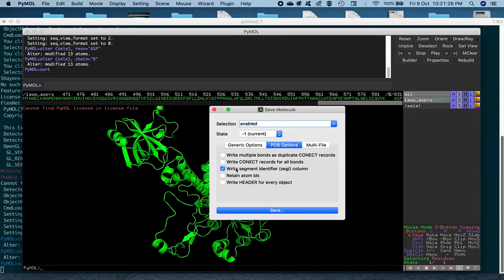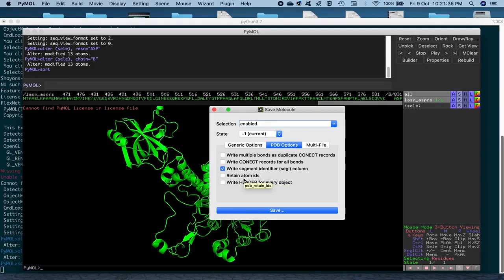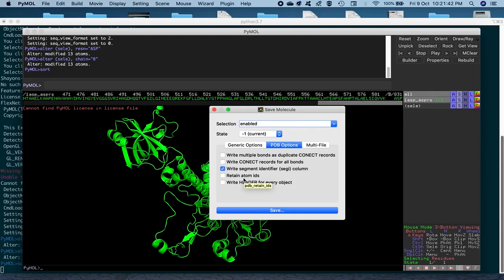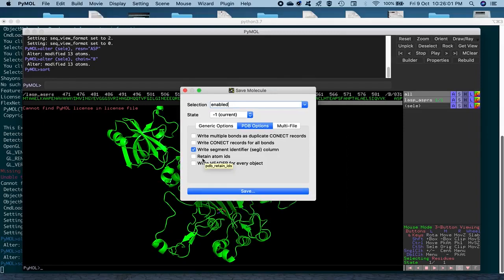So, this option is important when you're running a simulation after this, because once you have the structure of the complex, and you want to run a simulation, let's say with a software, an MD engine called GROMACS, it has certain recognizable capabilities, like it can recognize certain kind of atom IDs or atom types. Basically, you're going to leave this option unchecked for now.